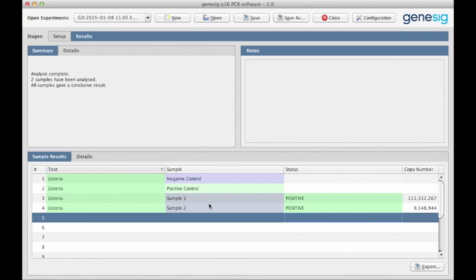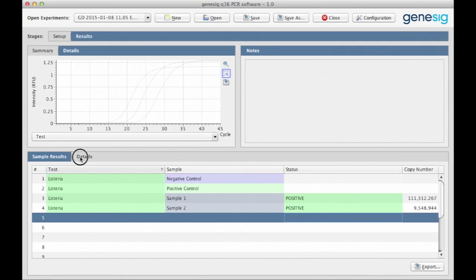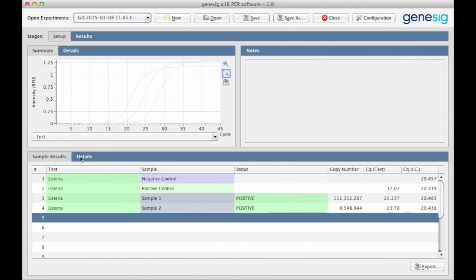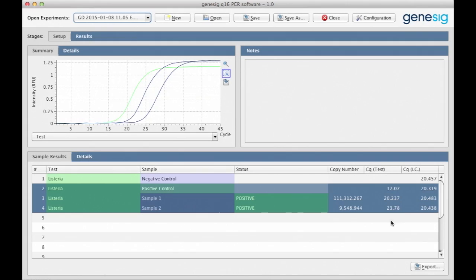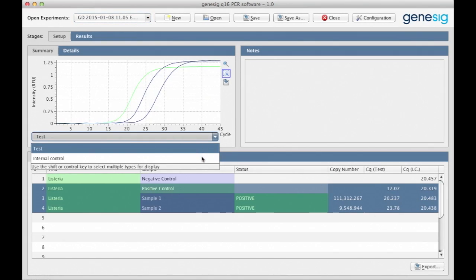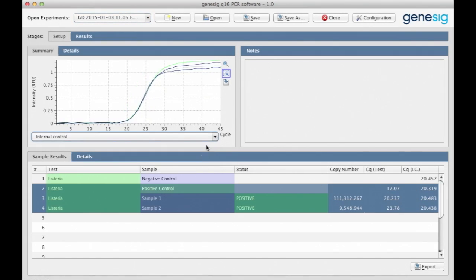However, if you're an experienced user and you would like to see the underlying data, you can see all of that by clicking the details tabs here and here. In this view, you can see the amplification plots and the CQ values. You can even switch between the views to see the internal control signal.